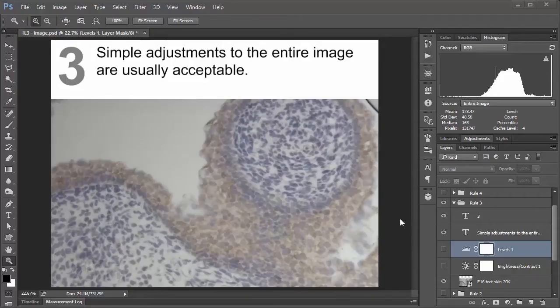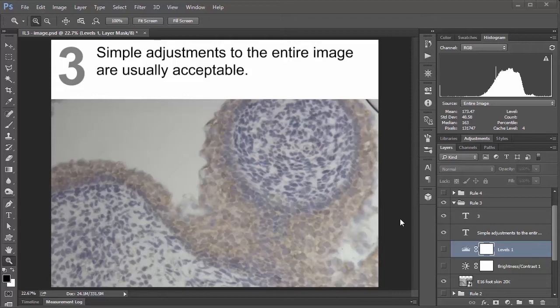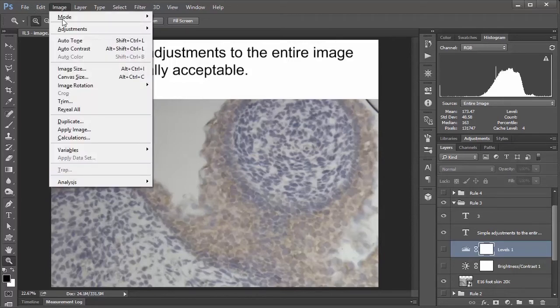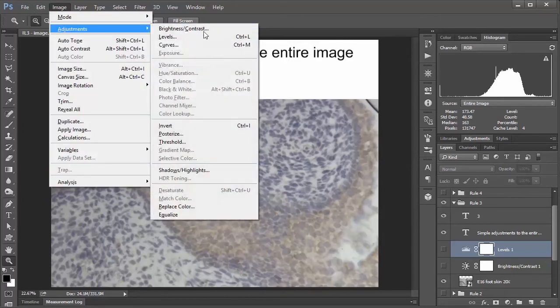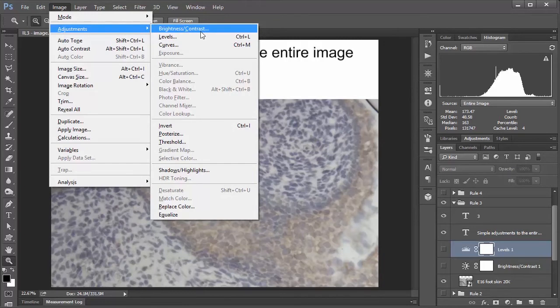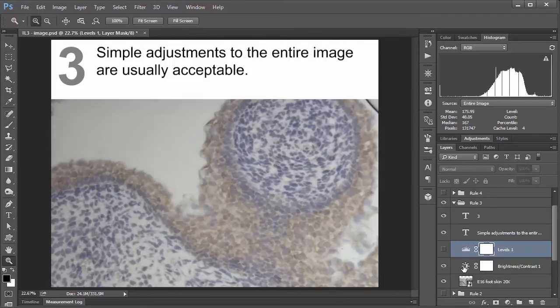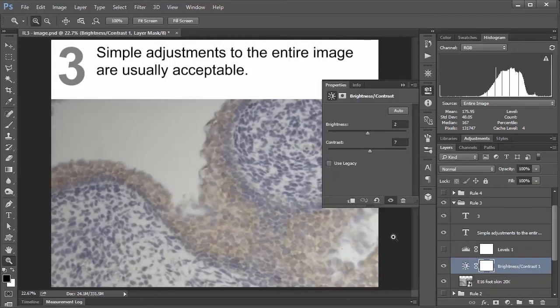Number three. Simple adjustments to the entire image are usually acceptable. And so I wanted to spend a bit of extra time on this one, because it might actually not be quite as simple as you may think. And so say you had an image like this where you might be tempted to adjust the contrast or brightness, and typically the way you go about this is to use the brightness contrast adjustment layer, or even the image adjustments brightness contrast, which I'd actually not recommend since it's a destructive change. But we'll talk about that a different time.